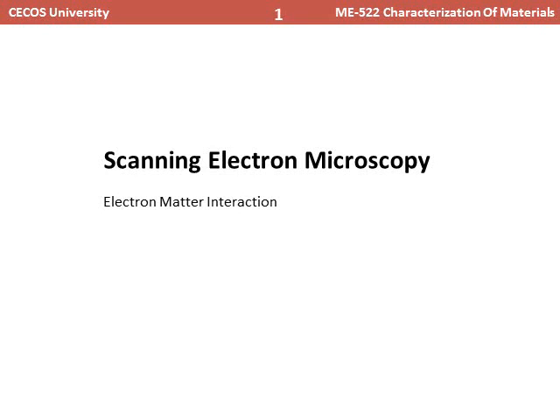Welcome to the lecture series on characterization of materials. Today is the last lecture regarding scanning electron microscopy, and the topic of interest is electron-matter interaction.